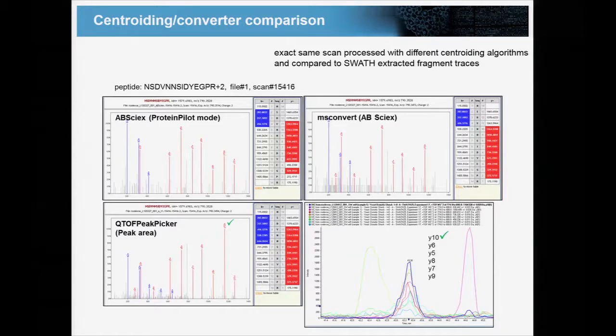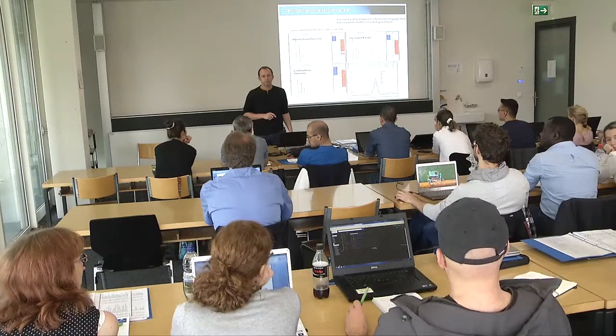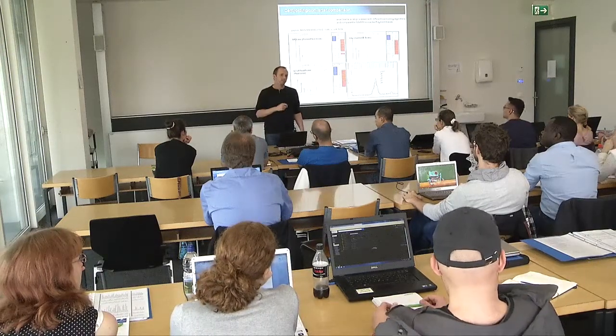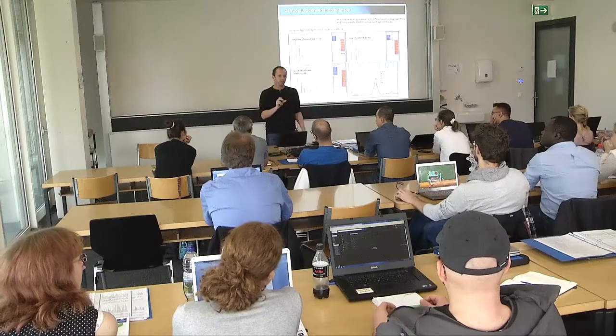Sorry. Yeah. So when you say the area under the curve, that means under the profile points, not exactly, because you don't have multiple MS2 spectra. Right, exactly. Okay, so I mean, the peak height as compared to the area under the profile, exactly that. Yeah. Okay.